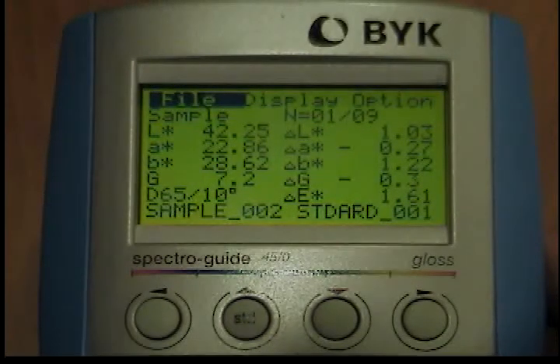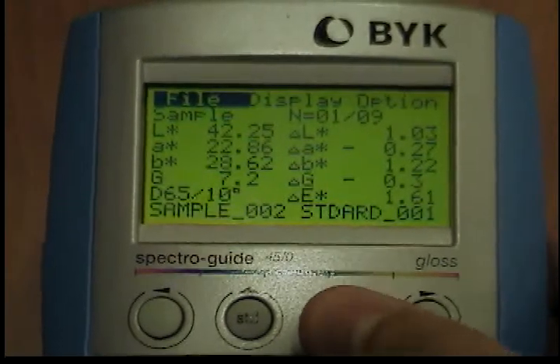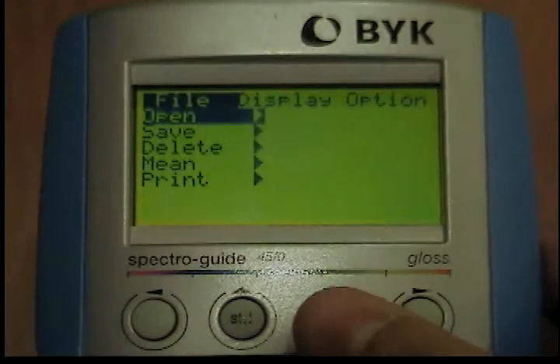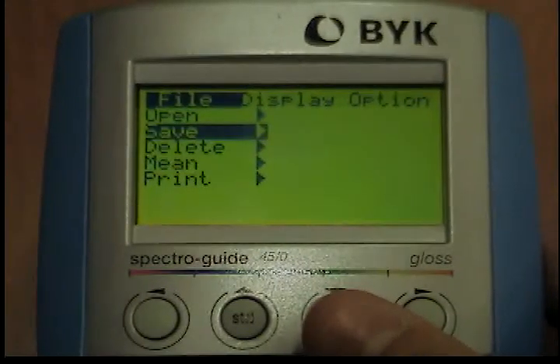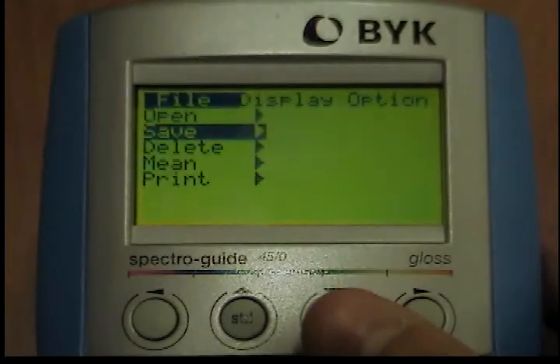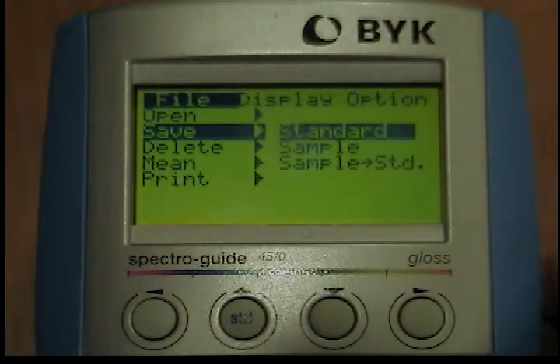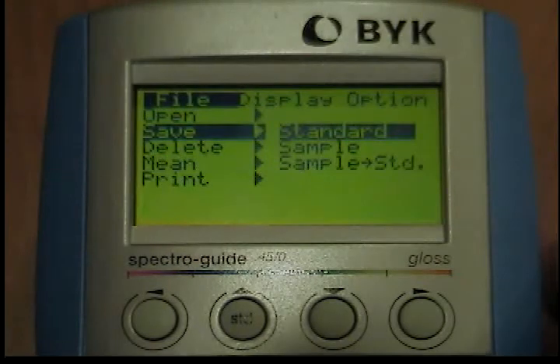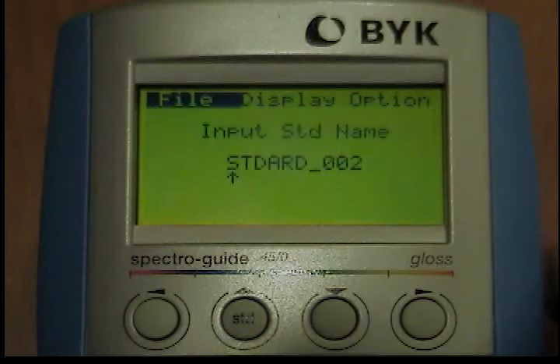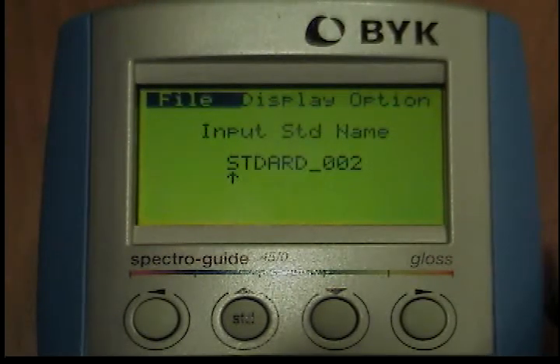Save File: from the File menu, use the Down button to move the cursor to the Save option. The submenu will open when you press the Operate button. Select Standard and press the Operate button again. The input menu will appear for the standard name.